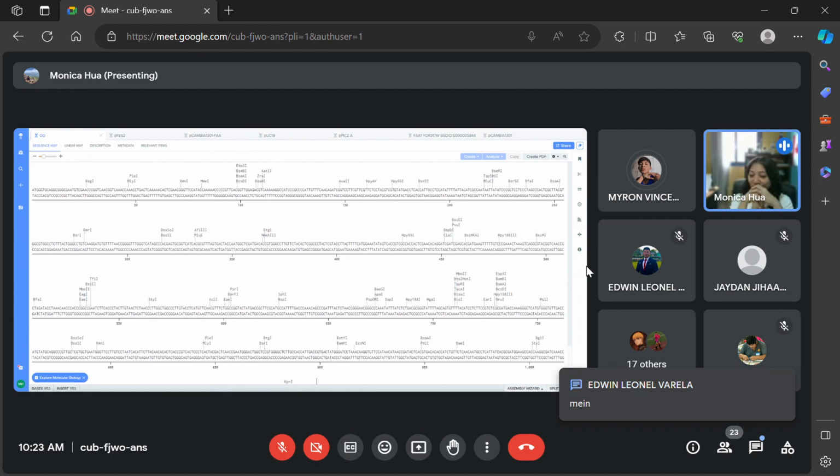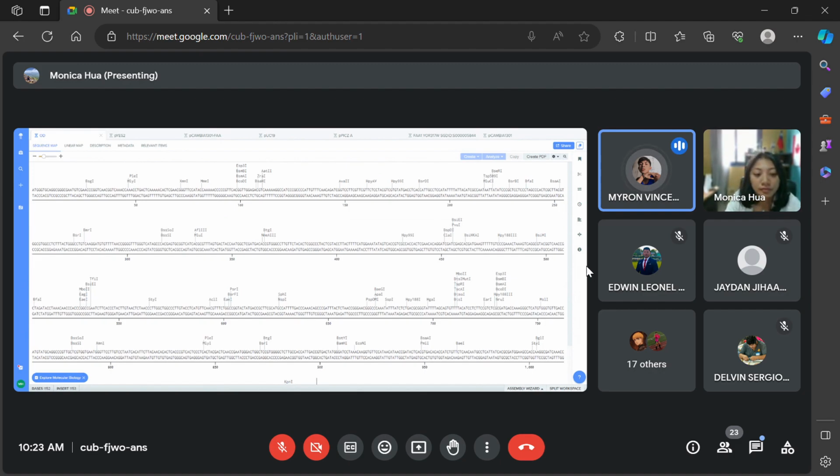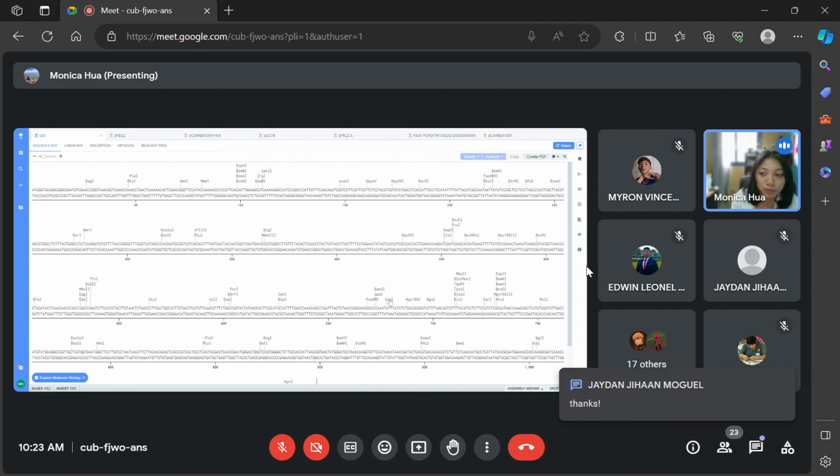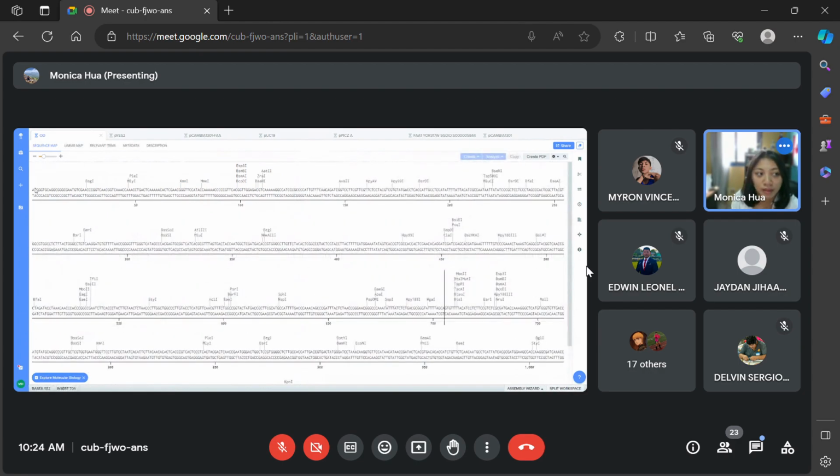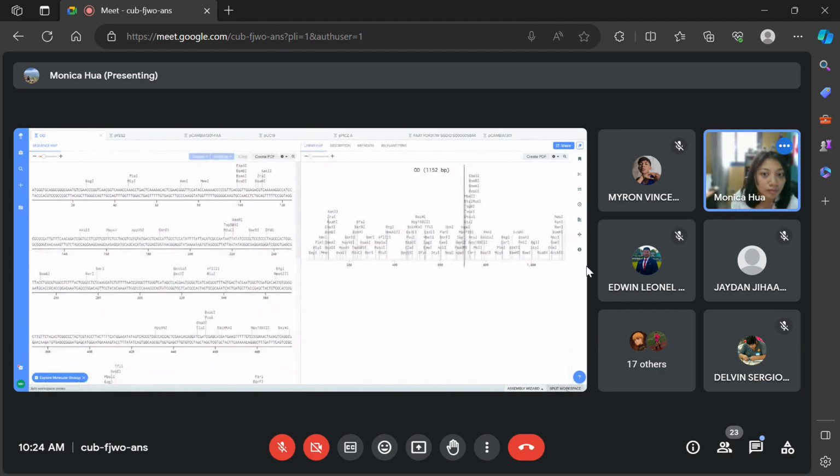And I'm not going to use OD as an example. I got the same that Edwin was saying, but if you want to separate them, you just go to the bottom right corner where it has a little question mark and you put split workspace. You could do it for the other ones too. I have no idea where you guys are at, but it's on the bottom right. I trust you guys will figure out your way.